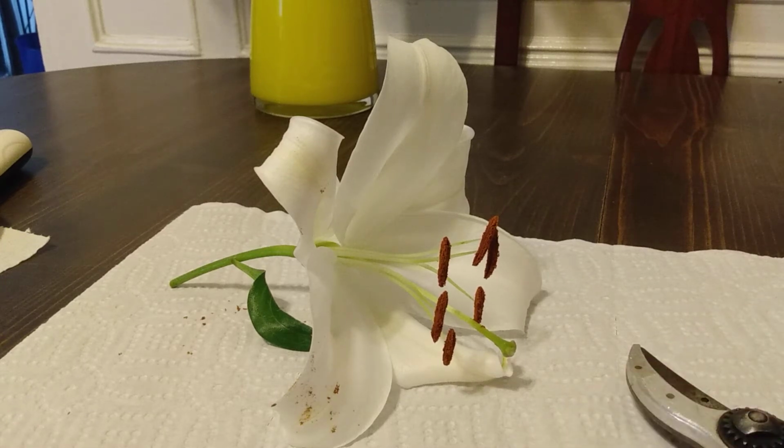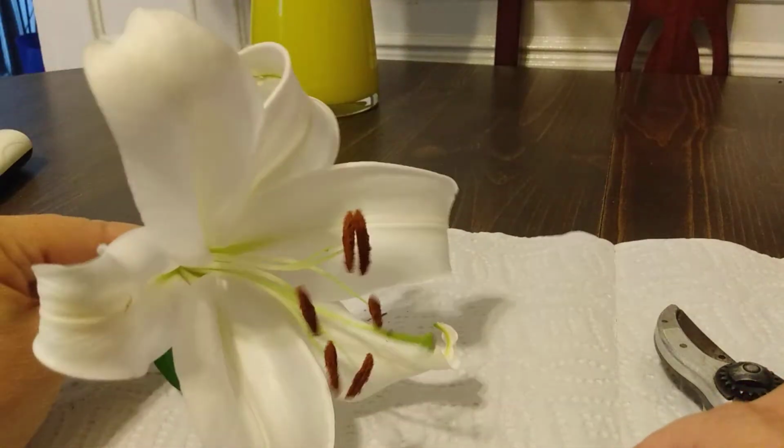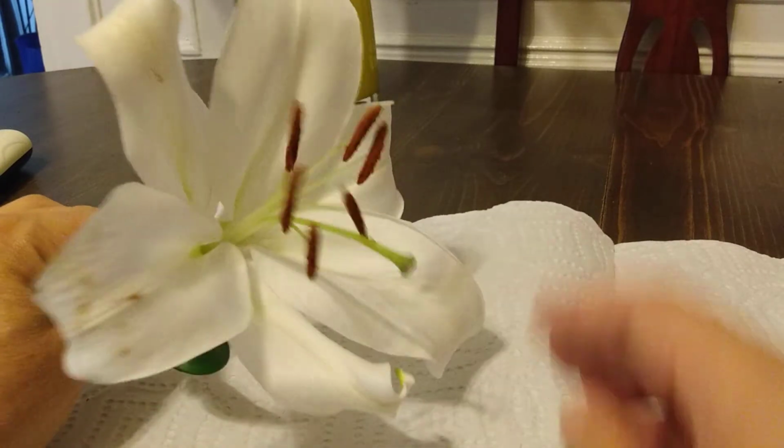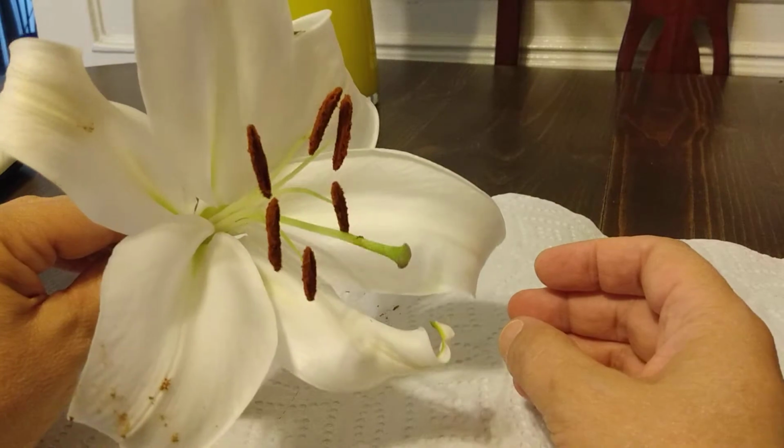We're going to look at the anatomy of a flower. So we're going to dissect, I have a lily here. We're not going to go through the functions. We're just going to, for the most part, be able to recognize the parts.